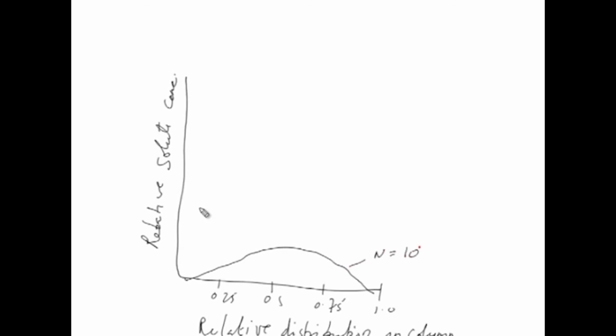So the fewer the theoretical plates, the lower the quality of the separation. Now let us increase the number of theoretical plates. If there are 100 theoretical plates, there will be certain improvement in the peak, and you will see that the peak is better than the previous one where theoretical plates were 10.